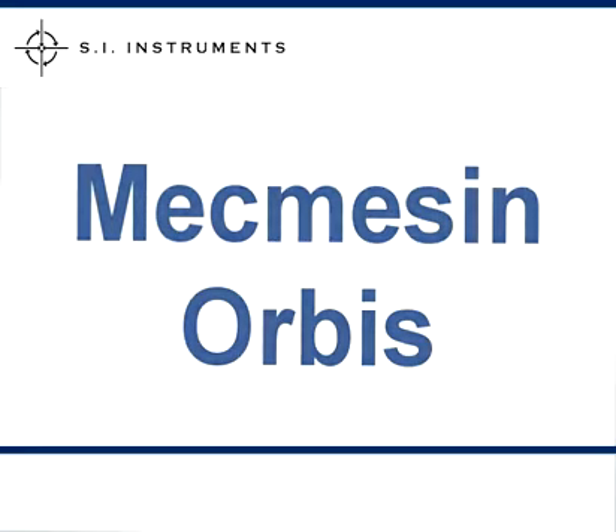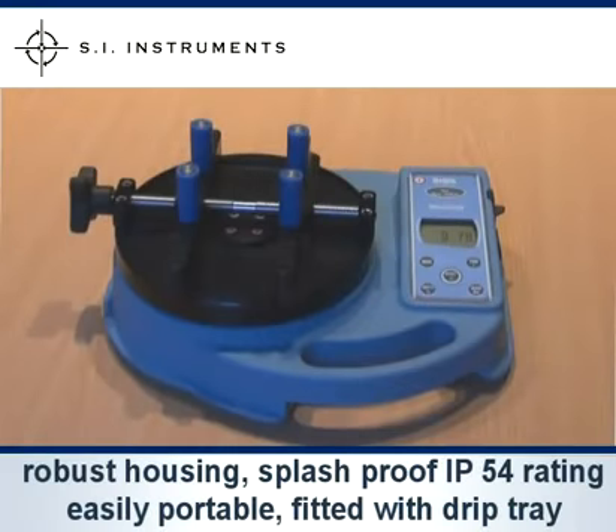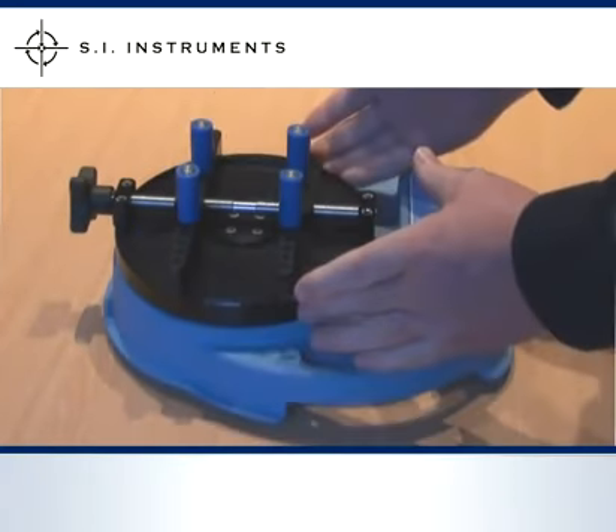The McMissan Orbis is designed for closure torque testing. The unit has a solid robust housing with splash proof IP54 rating, is easily portable and is fitted with a hard anodised aluminium bottle holder plate with a drip tray.